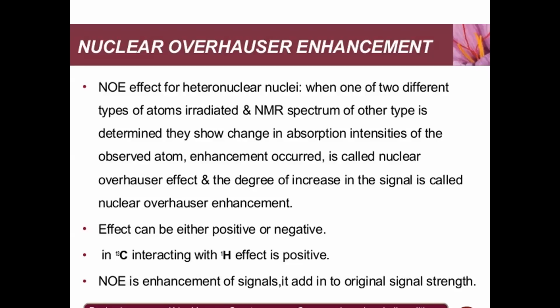Nuclear Overhauser enhancement. This method was discovered by Overhauser, so it is known as the nuclear Overhauser enhancement method. Then, what is the nuclear Overhauser enhancement method?